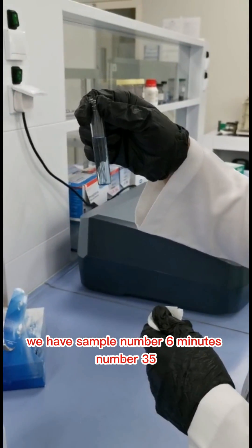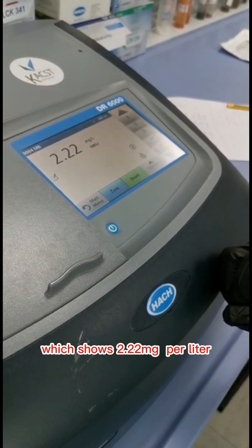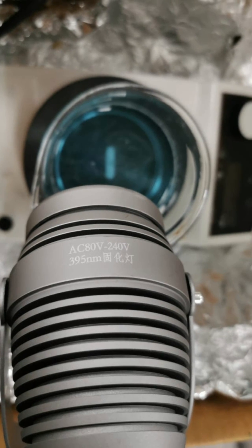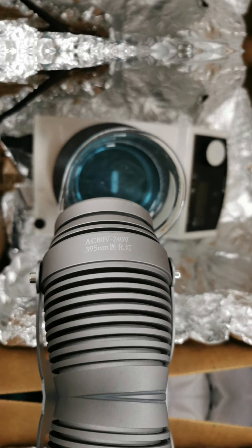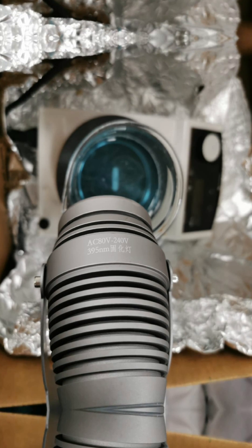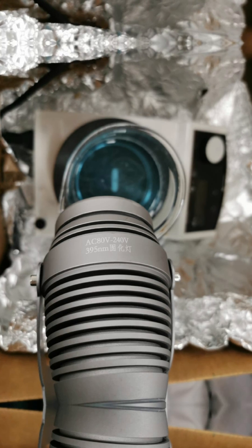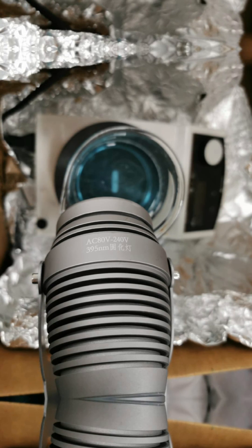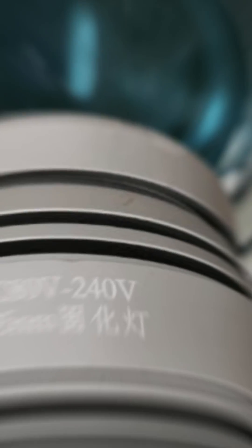We have sample number 6, minute number 35, which shows 2.22 mg per liter. The last concluding concentration was around 2 ppm, which shows that the catalyst and oxidizing agent we used achieved 90% degradation of the dye. This proves that the catalyst has the potential of degrading the dye.